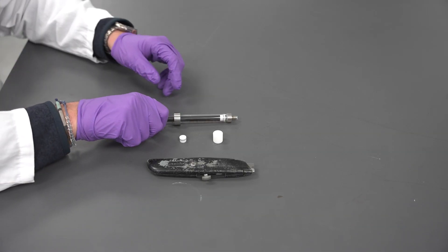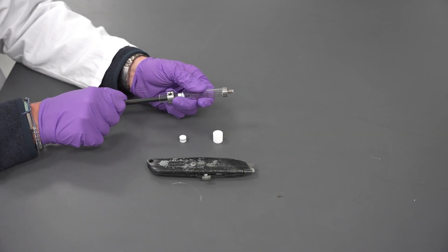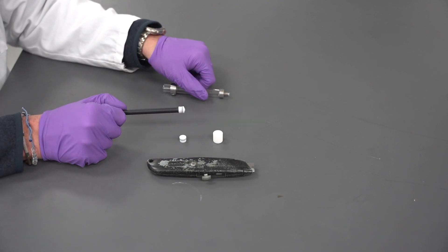Pull the black plunger out of the barrel of the syringe and use the razor knife to cut the old plunger tip off the plunger.